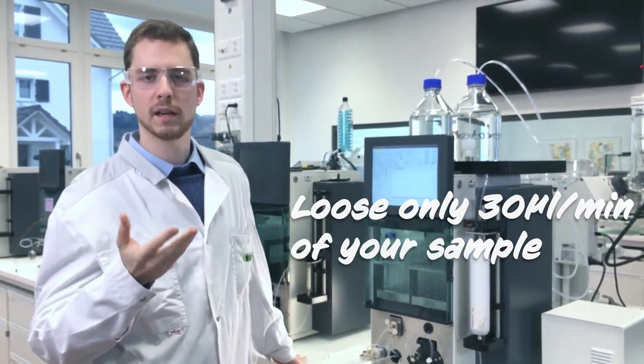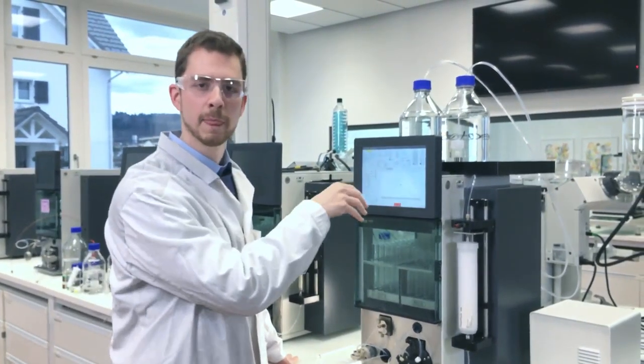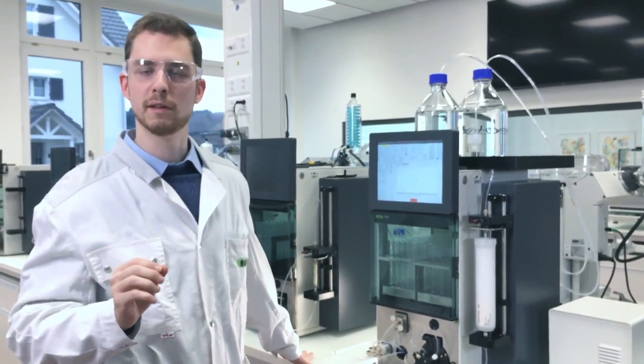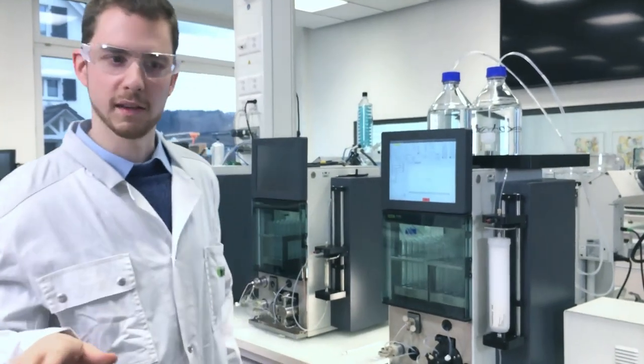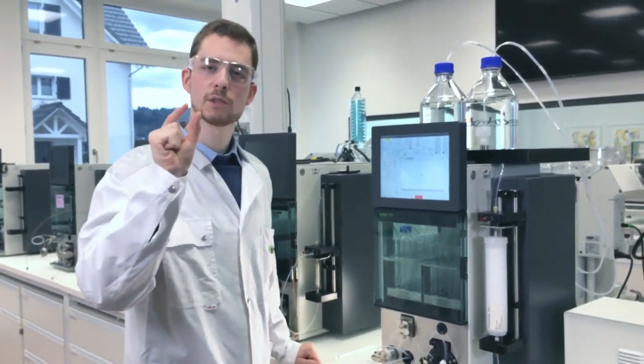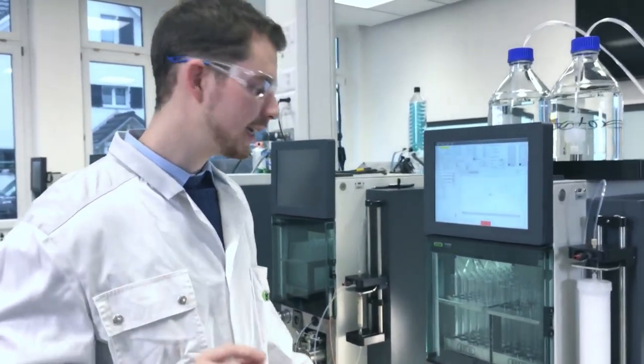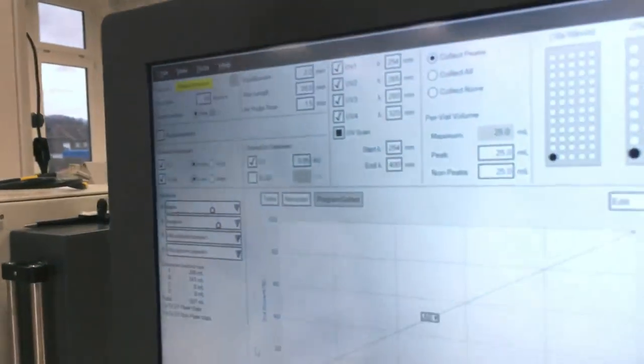You could also ask, okay, but how complicated is the setting? How do I define the correct temperature for evaporation? I tell you, you don't need to do anything. The droplets are so small that the solvent easily evaporates at room temperature. And the only click you have to do is here.